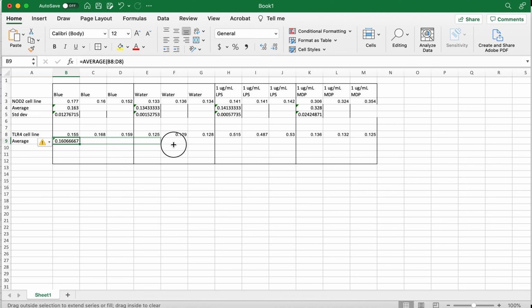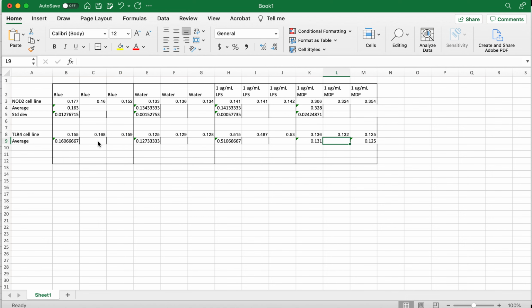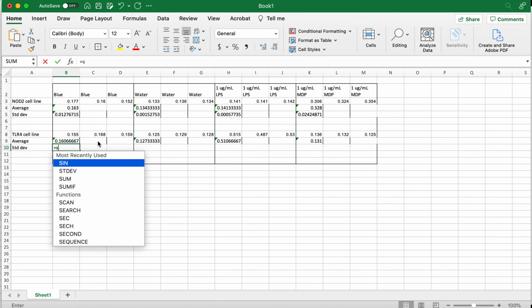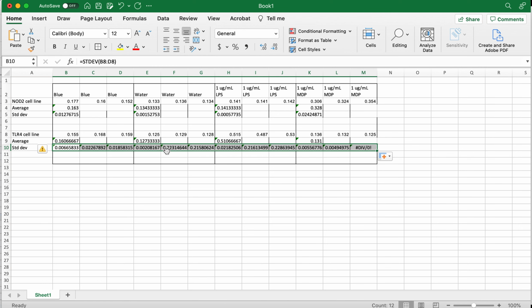And we are first finding out the means, and we're doing that for all 4 conditions and removing any readings that are not relevant. And then we will find our measure of dispersion, which is the standard deviation. Please remember, you're going to use only those readings that belong to the same group or same condition and the same cell line.